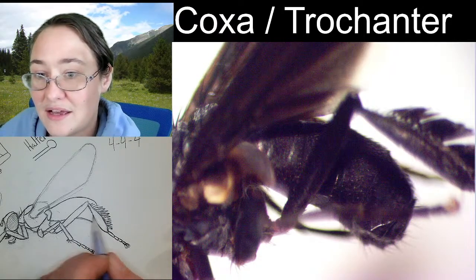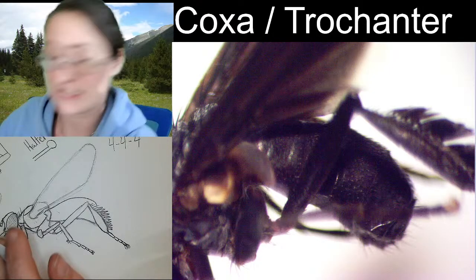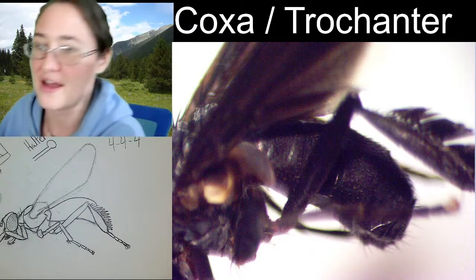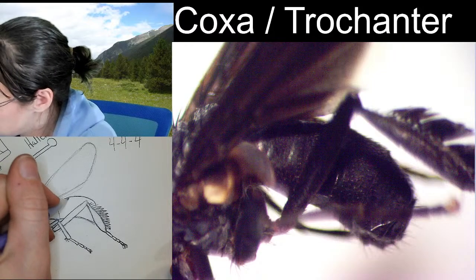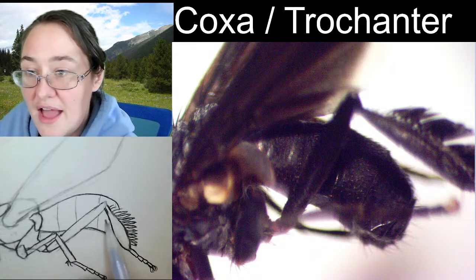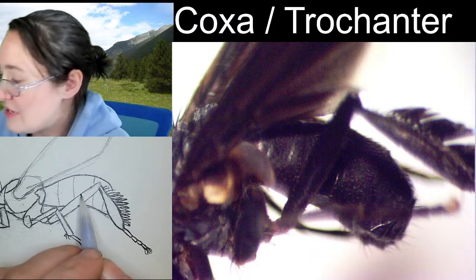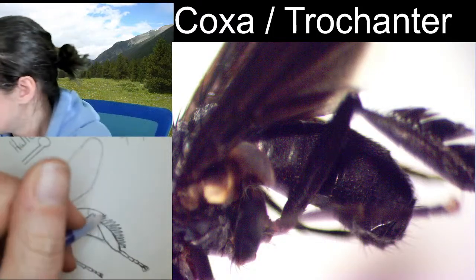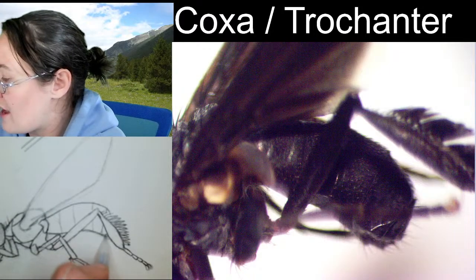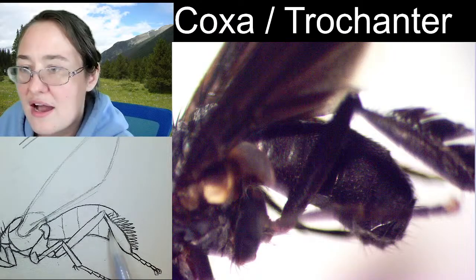I can also zoom in on the end of the abdomen in case you want to add any of those more details. I said 6, right? 1, 2, 3, 4, 5? I hope I said 5. Alright, so the first 3 segments are fairly wide and equal to one another. The 4th segment is just a little bit smaller, and the 5th one is really kind of a teeny tiny one at the end. I'll go ahead and zoom in on that one to show you momentarily.